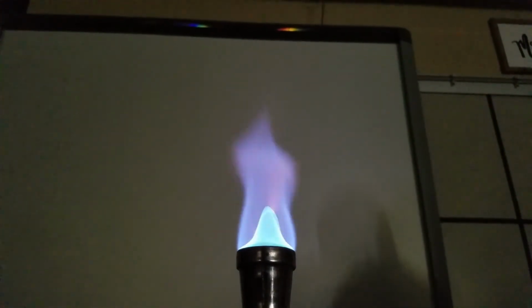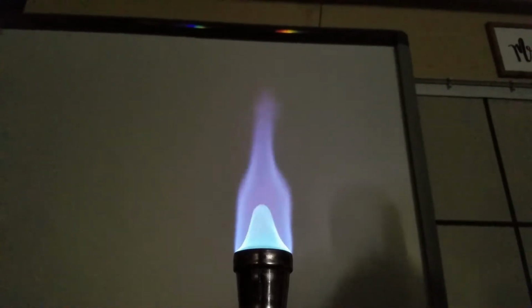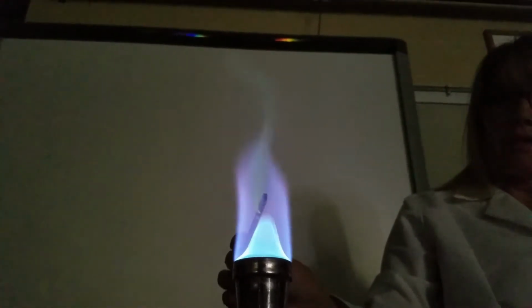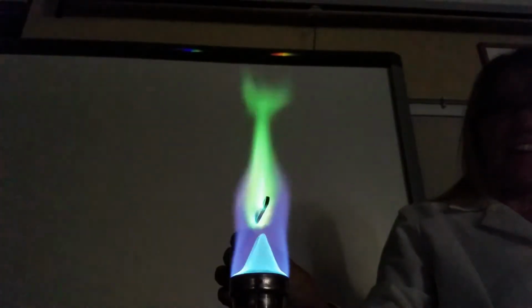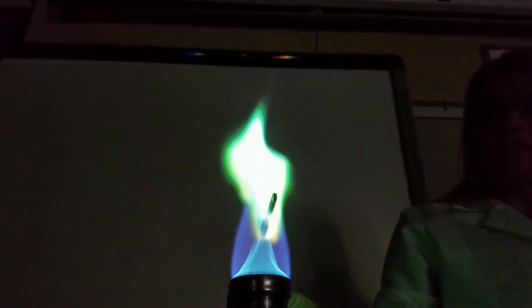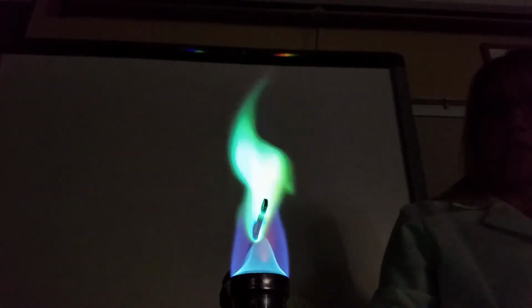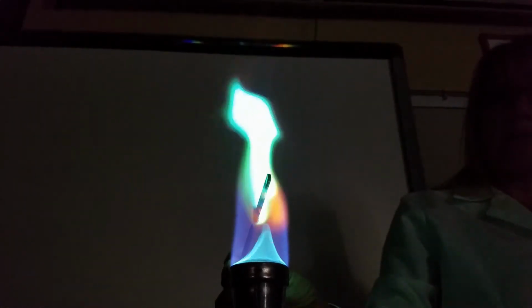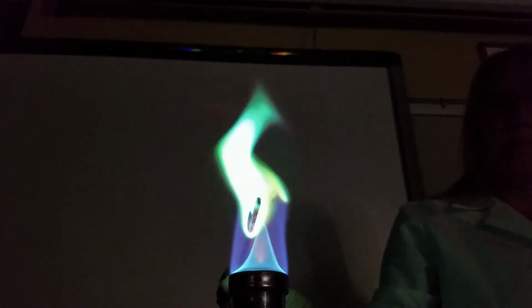All right, the third one is cupric chloride. This is the one that looks different even in the solution. And it's kind of really cool. So look at that flame. Record your observations in your data table for cupric chloride.